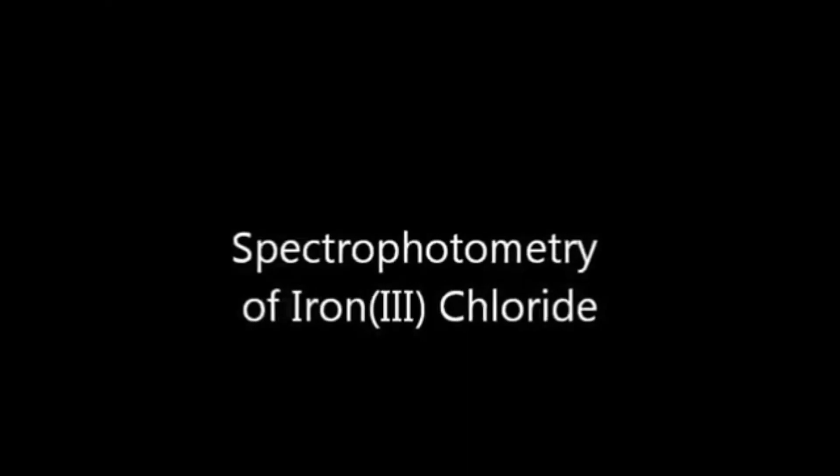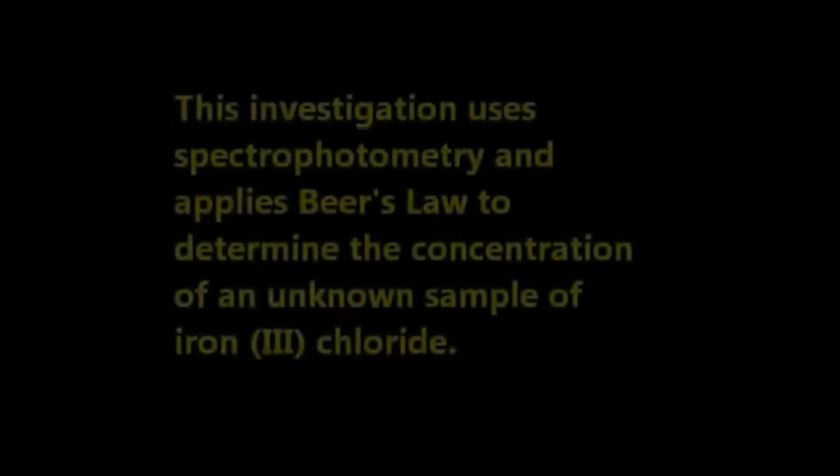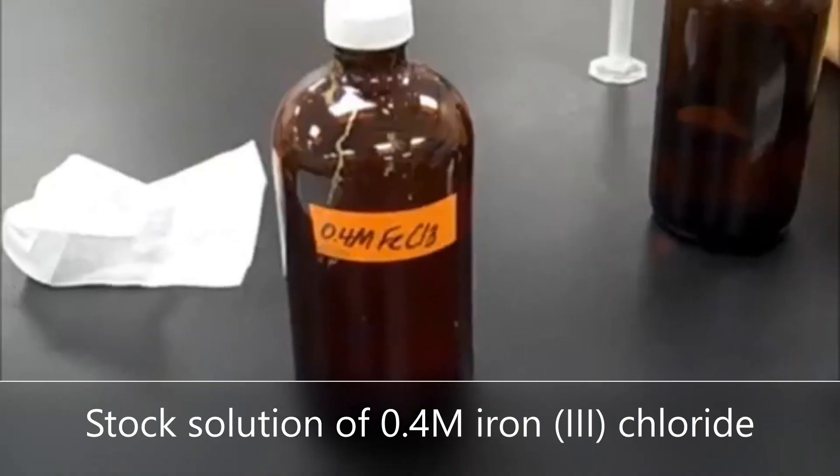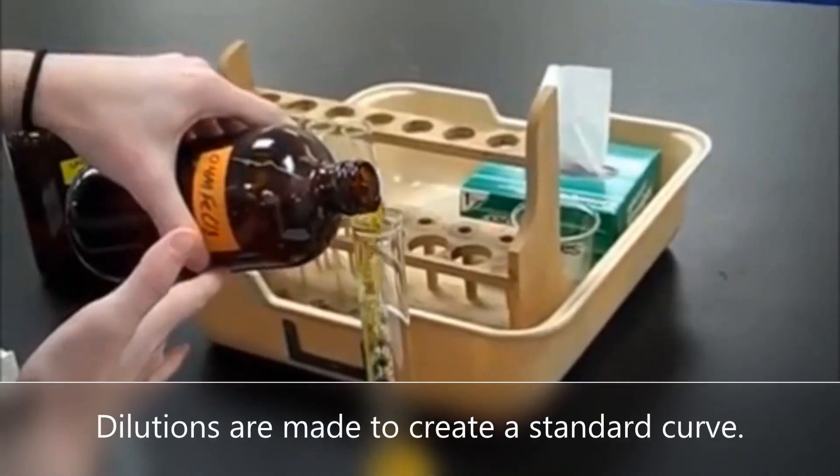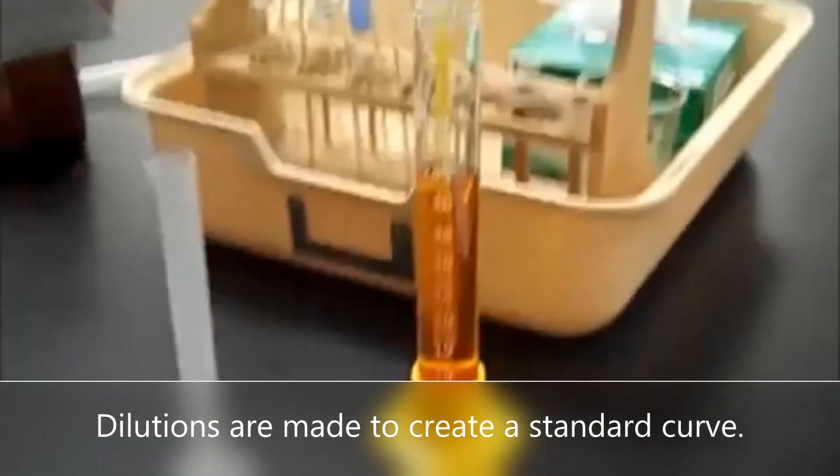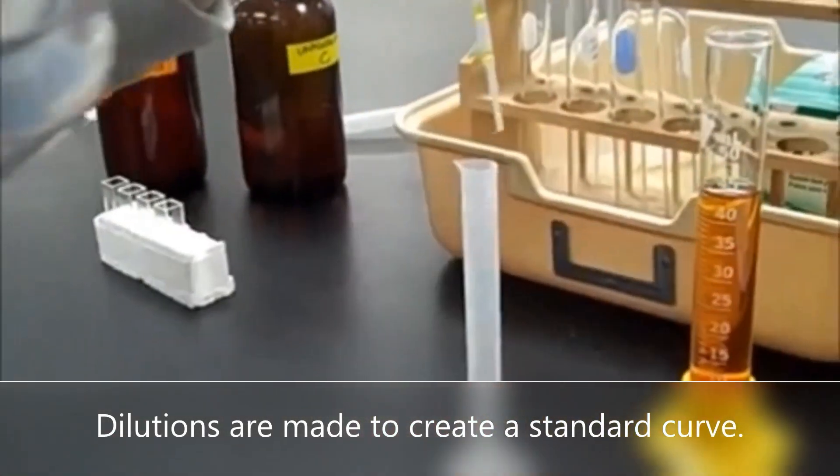This experiment uses spectrophotometry to analyze samples of iron chloride by using the Beer-Lambert law to determine the concentration of an unknown sample. A stock solution of 0.4 molar iron chloride is used to create a number of samples which will be used to create a standard curve.